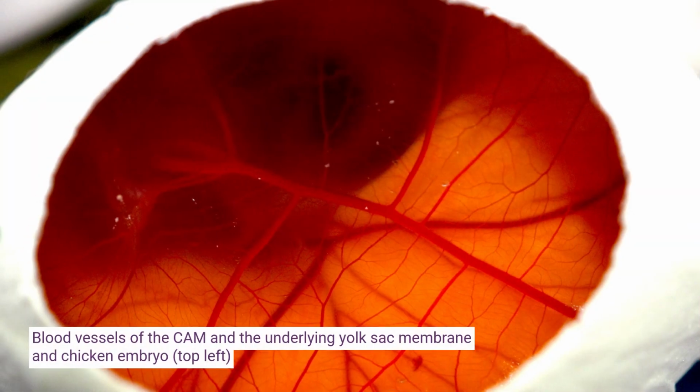Obviously, we are monitoring a variety of vascular parameters like the functional vessel density, vessel length, vessel diameters, as well as perfusion rates, and also the vessel leakiness is something we've been looking into quite recently.